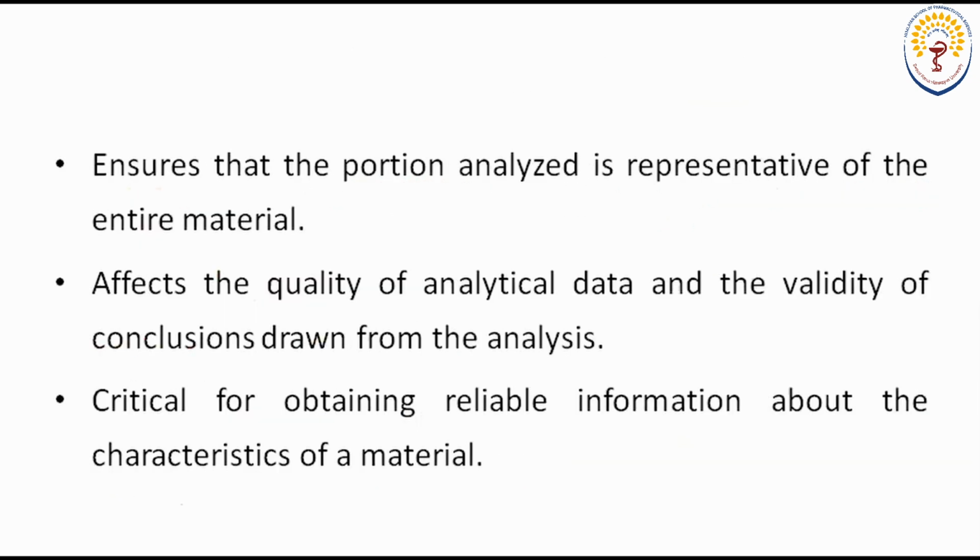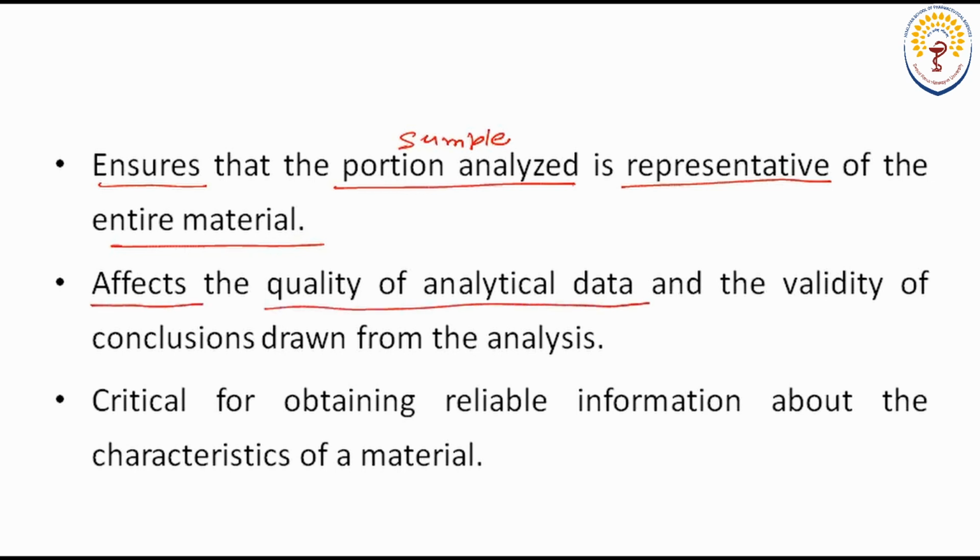Now when you are taking the sample, you have to ensure that the portion, that means the sample which is being analyzed, is representative of the entire material. Sampling is very important because it affects the quality of the analytical data that you get after analysis, and sampling also affects the validity of the conclusions.